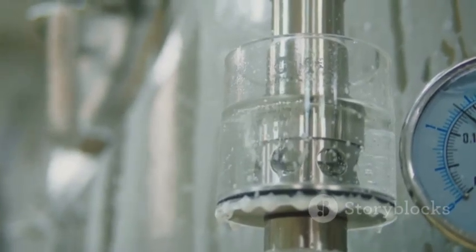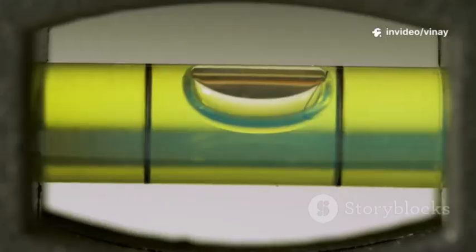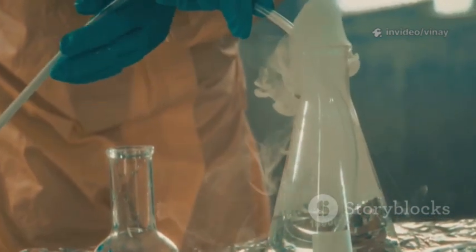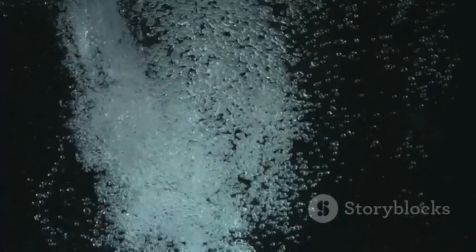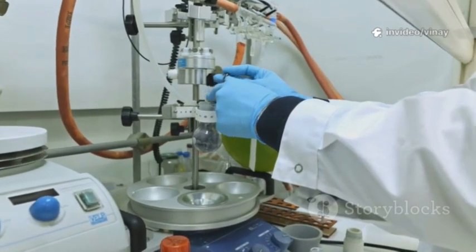However, some of the gas molecules will actually dissolve into the liquid on the high-pressure side, travel through the liquid held in the pores, and then come out of the solution on the low-pressure side. This very slow, steady movement of gas through the wet filter is called diffusion. We use a very sensitive machine to measure the rate of this gas flow.